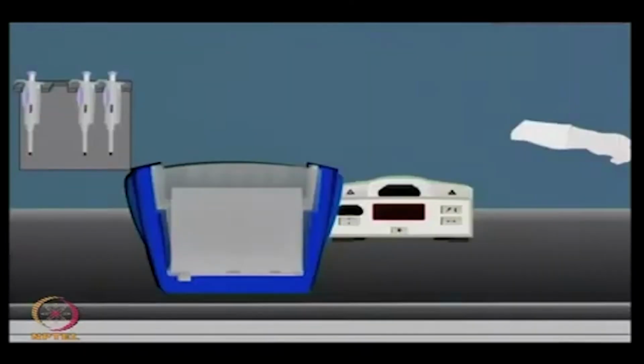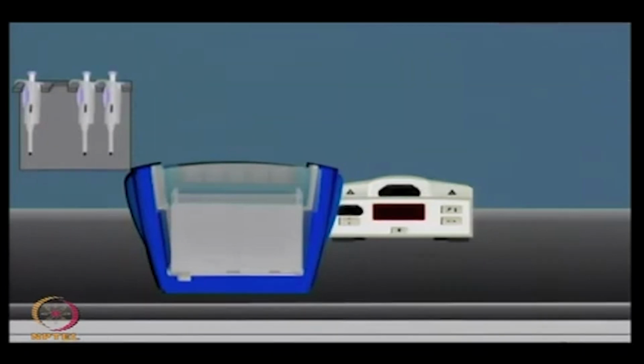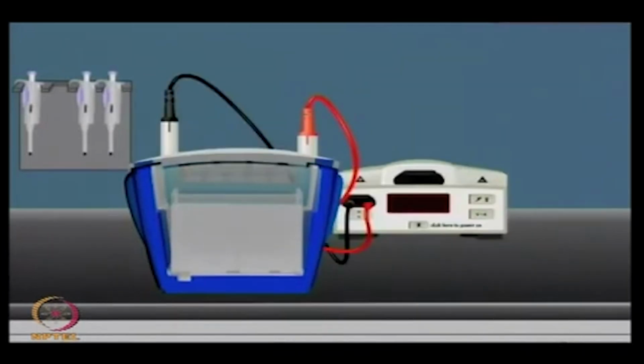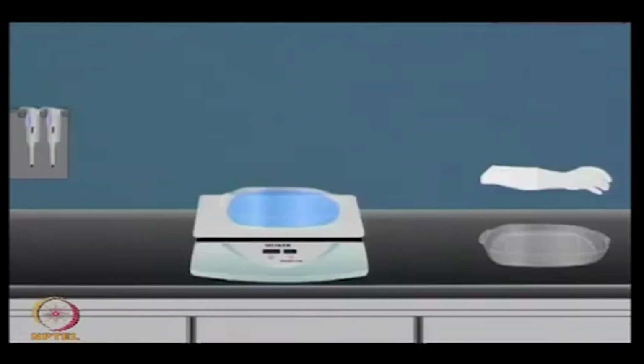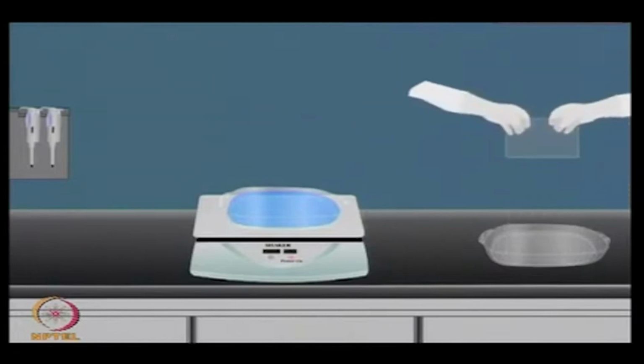Once the gel is polymerized, you can add the IPG strip, and now ensure that the assembly is properly sealed and buffers are properly placed, so that proteins can be separated based on their molecular weight. Depending on the gel length, you can perform the second dimension separation for a few hours. After second dimension separation is done, we can perform the staining and de-staining.